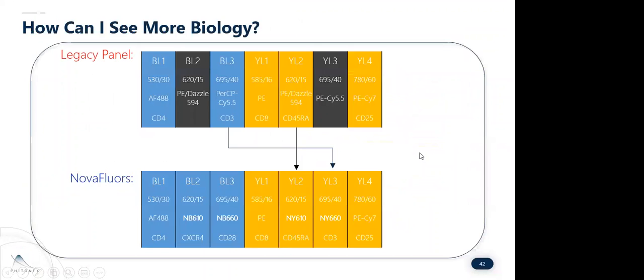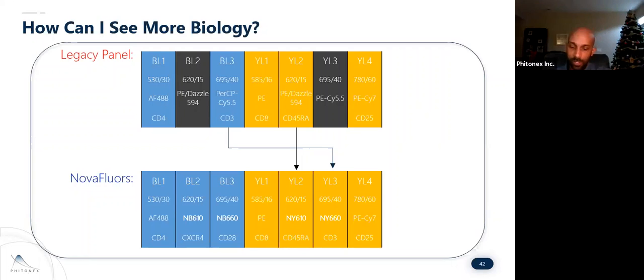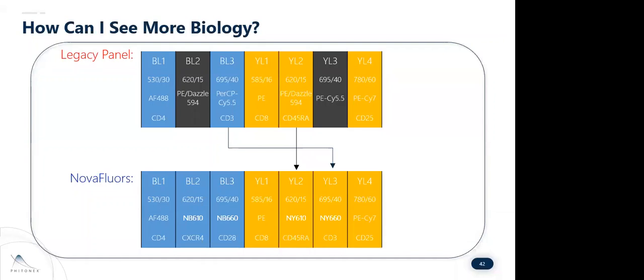Anson, we have another question. What about the BUV dyes, which are polymers? Do they also have the tendency to degrade? You'll probably want to follow up on this one, Seddon, but I don't think they have the same degradation problems, but I do think that because they are polymer dyes, there is a problem with aggregation. Is that correct? Yes, there's that, but also basically BUV, beyond BUV395, is actually functioning as a tandem.